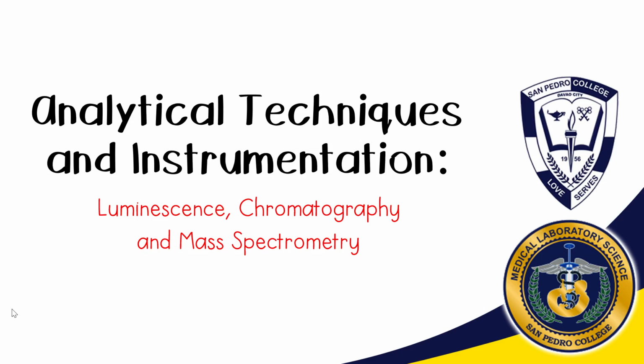For our discussion, expect that there will be a lot of videos that you will be watching. Since we are talking about instrumentation, this is a very technical topic. We will discuss the components, the function of each component, and the overall process of your methods and principles. I thought that at least you would get an idea and could imagine what these principles are really doing. During your internship, when you use machines, you cannot see the work inside them, which is what analytical techniques and instrumentation is all about.